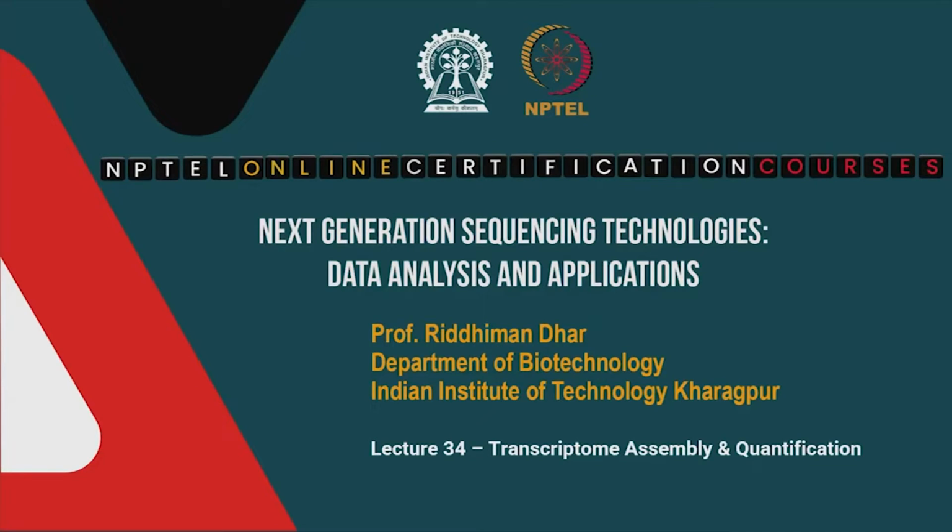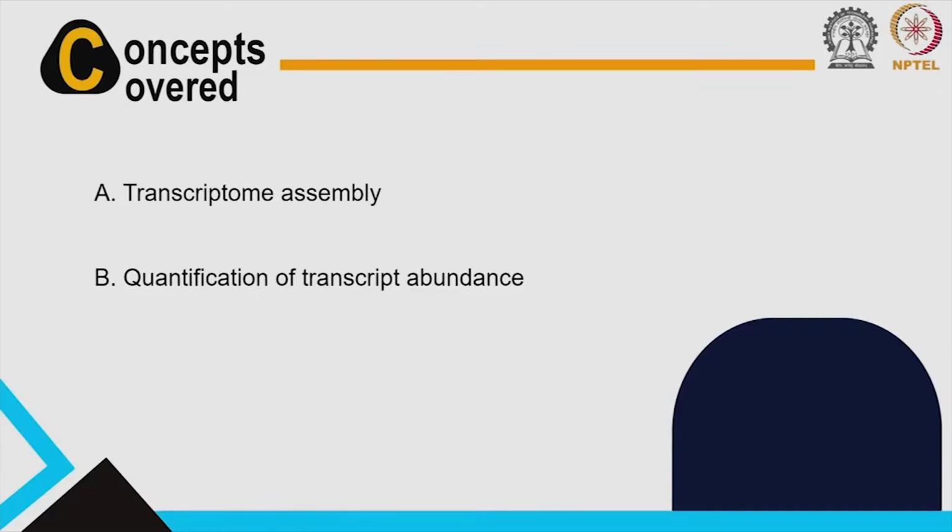In the last class we talked about read mapping for transcriptome analysis and some of the methods that we use. So, we will continue that discussion and talk about the next steps, which are transcriptome assembly and quantification. These are the concepts that we will be covering today.